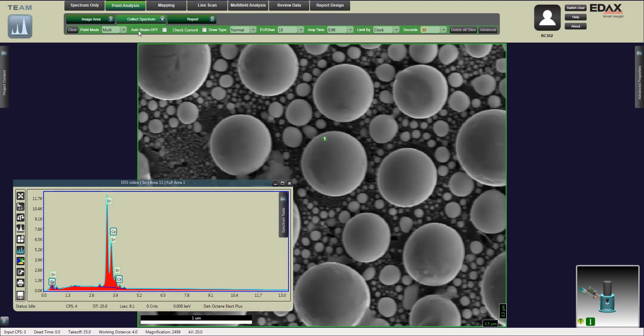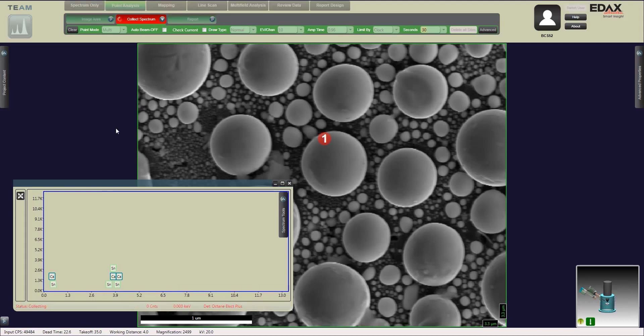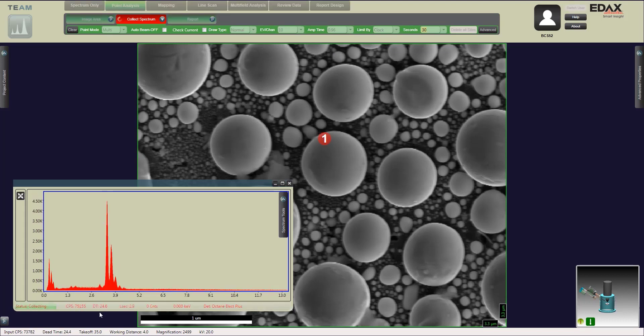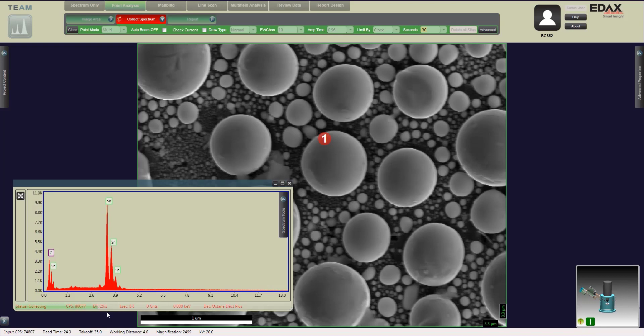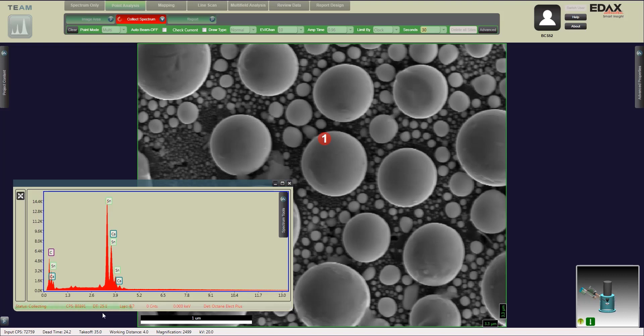I'll switch the amp time, recollect the spectrum. Now we're right around the counts we want and we're about 25% dead time. We can notice the green bar at the bottom of the graph that'll tell you how long the scan is going to take.